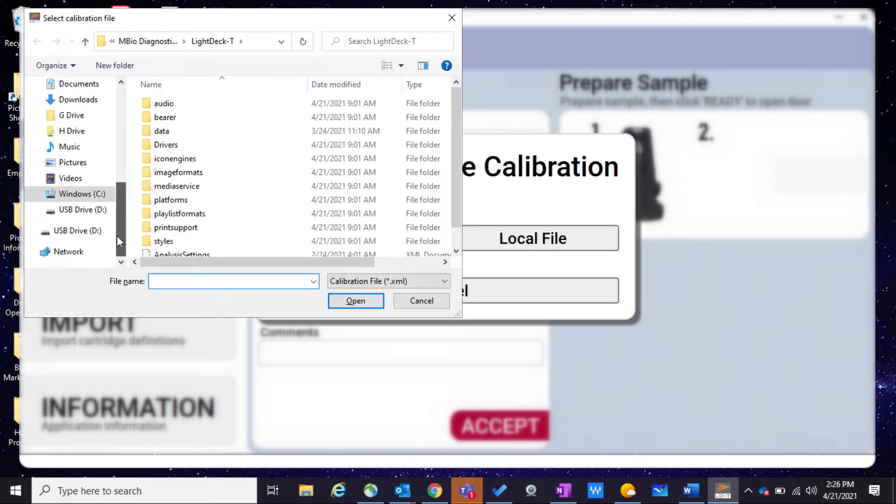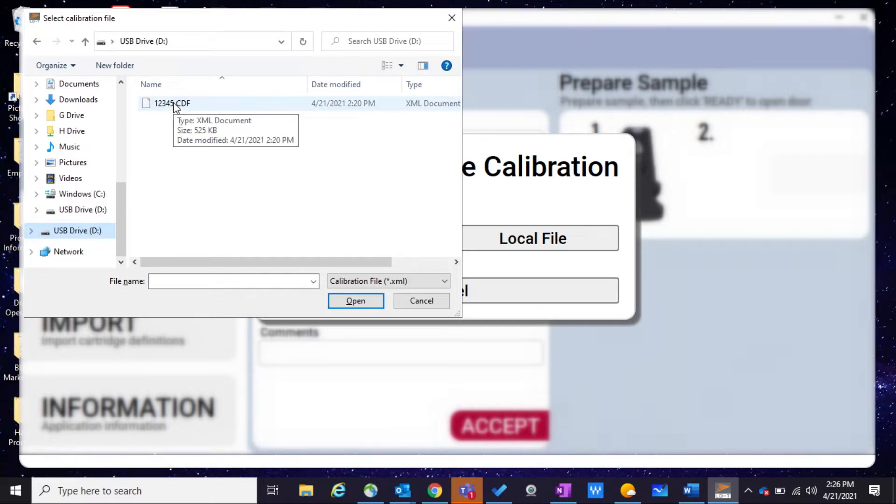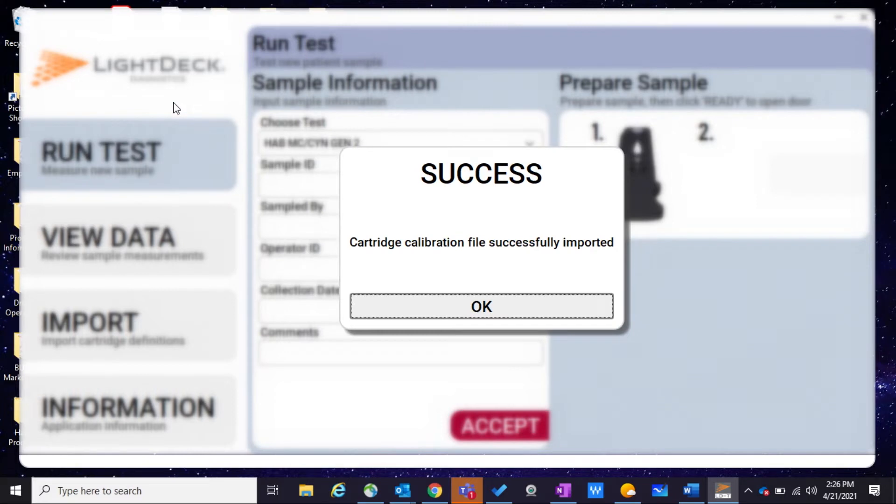Go to the USB drive and select the CDF XML file in that USB drive. And we're successful.